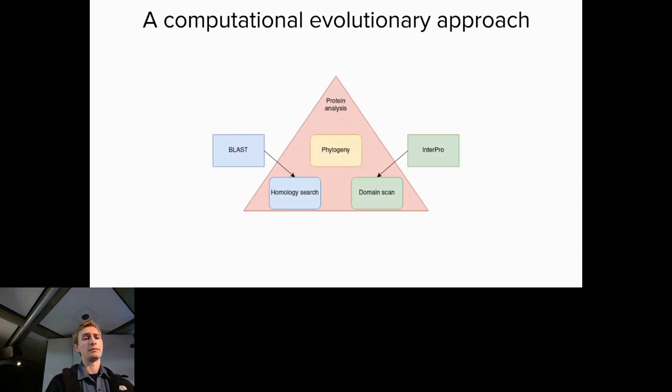And this is just a very basic diagram of our methodology. So we just run our proteins through BLAST and then InterProScan on all of those homologous proteins. And then we trace back the phylogenetic data using EUtils and other taxon grabbing software.